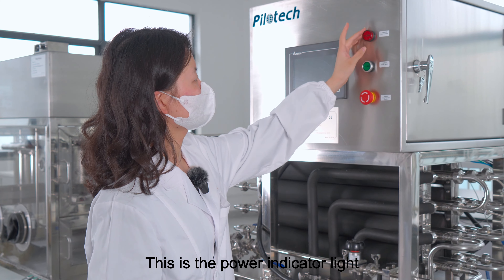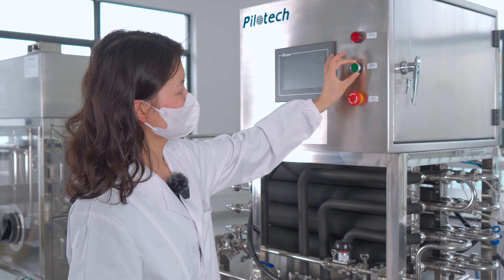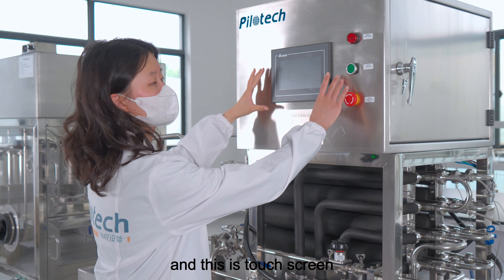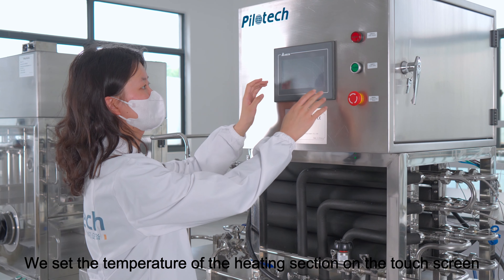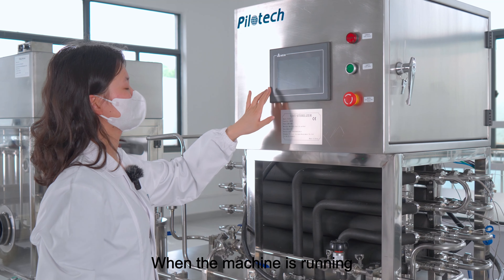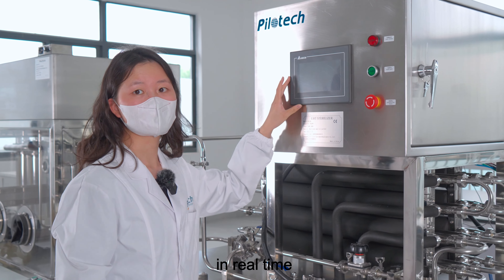This is the power indicator light. This is the power switch. This is the emergency stop switch. And this is the touchscreen. We set the temperature of the heating section on the touchscreen. When the machine is running, the touchscreen will display nine temperature measurement points in real-time.